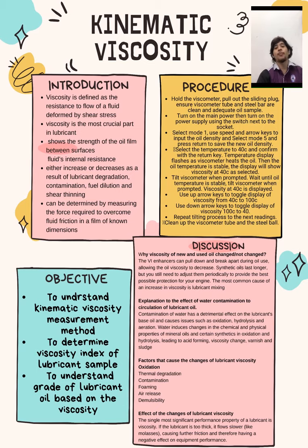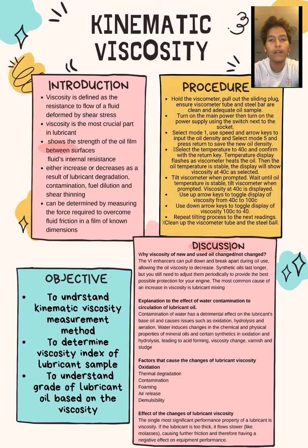I'm here to explain the discussion for kinematic viscosity lab 1. The question given to us is why the viscosity of new and used oil changes or might not change. This is because the viscosity enhancer can pull down or break apart during oil use, leading the oil viscosity to decrease. Synthetic oil might last longer, but you need to change it periodically to provide the best possible protection for your engine.